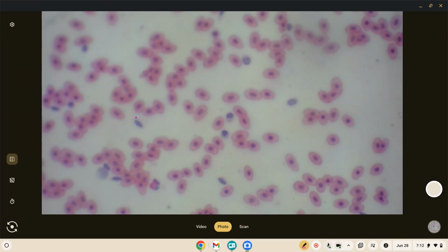There are lots more immune cells in the frog's body. Just lots more immune cells. That's just a few of them circled out. There's still more. Wonder if you can find how many there are. Tell me in the comments how many you found.